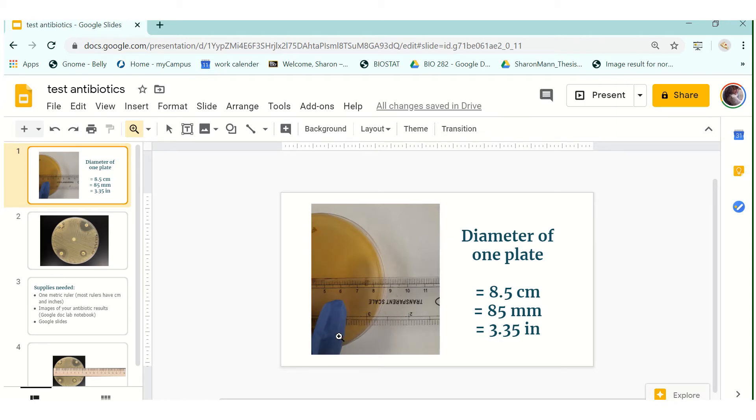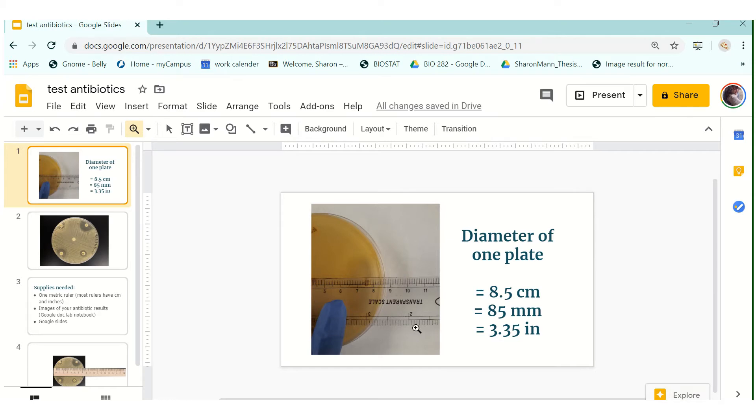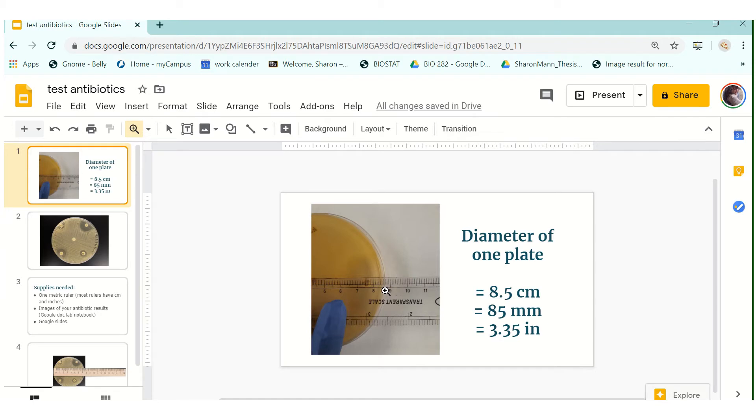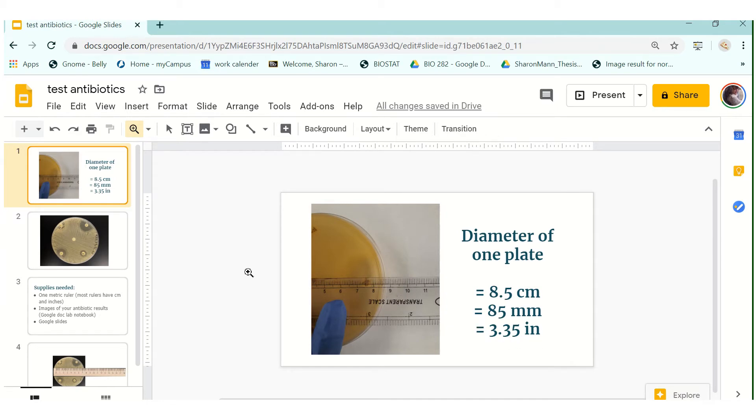So the purpose of this slide here is to show you the diameter of one petri dish that we're using or the TSA plate. So here I just have a standard ruler that has inches on one side and on the other side it's a metric ruler so these are centimeters and what I'm showing you here is that the diameter of one plate is 8.5 centimeters. So if we convert that that means that the diameter of one plate is 85 millimeters and 3.35 inches.